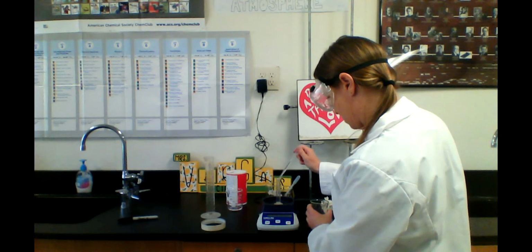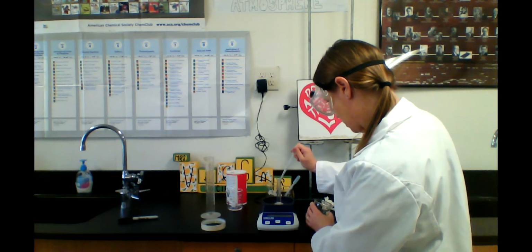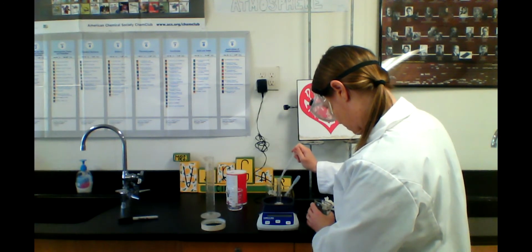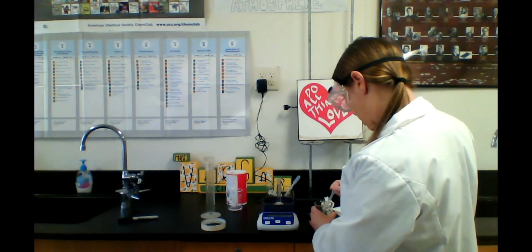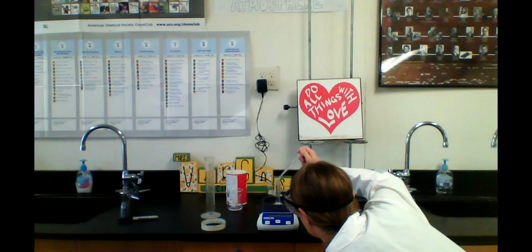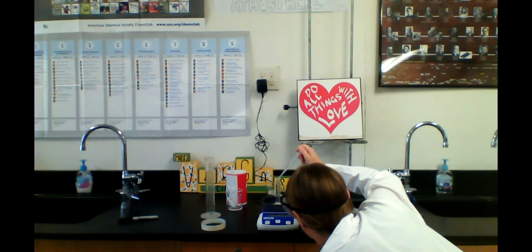There we go. 2, 3, 4, and let's get the meniscus, bottom of the meniscus, all the way up to that 10 mil mark. Perfect. Ooh, that is very dense.